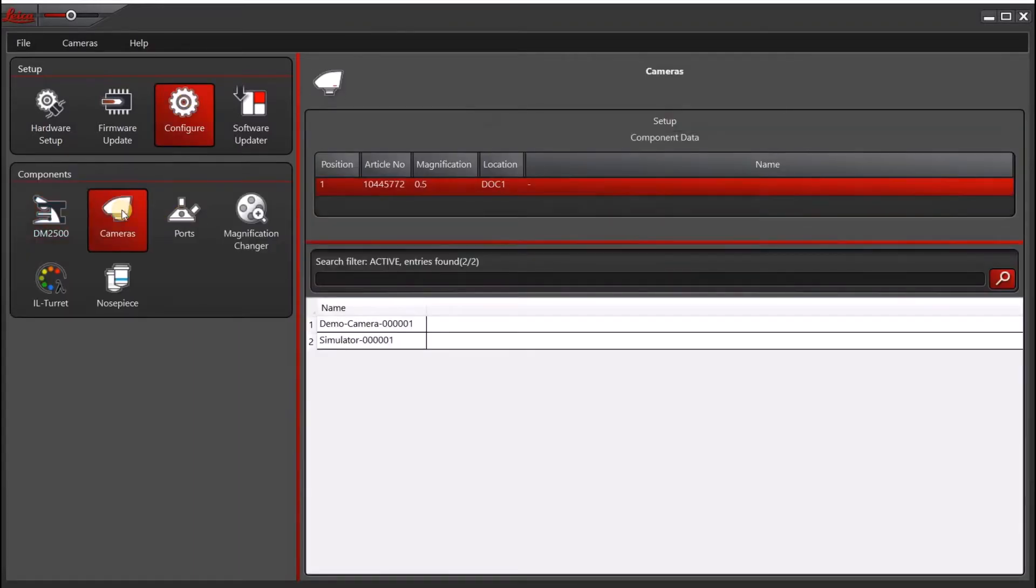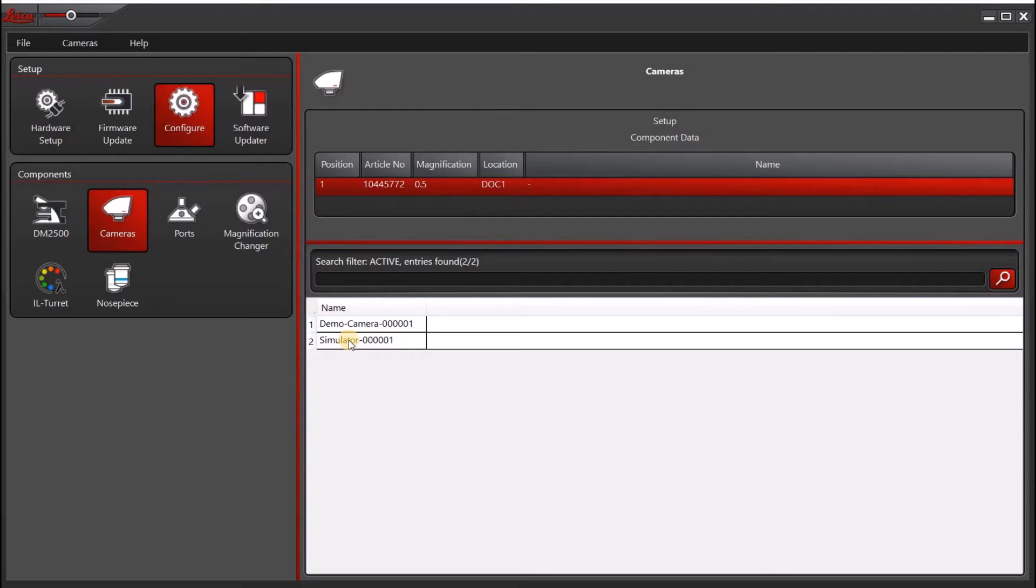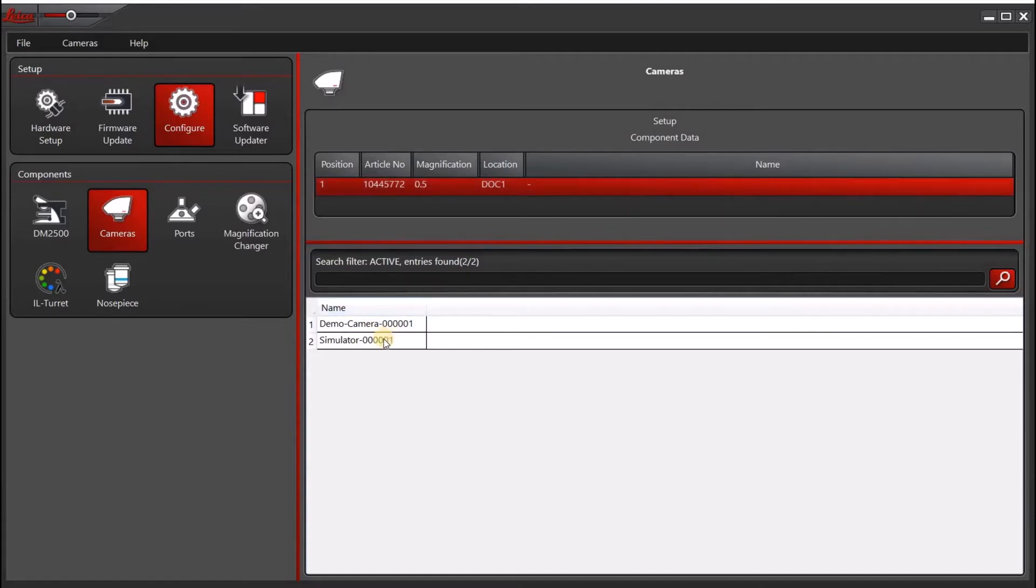make sure you have selected one of the following, or at the very least, do not select a camera that is actually on your microscope. So you'll see here it's actually blank, which is fine. You can also go ahead and select the demo camera or the simulator.